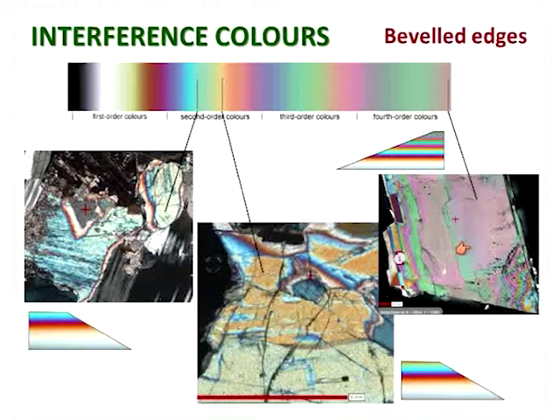By the time you get into third order, you're talking about very odd, slightly washed out colors, which are very much more pastel. I don't know why this is, but the colors seem to be restricted to more or less a pale green and a pink. It is quite difficult to see many of the other colors in there. In fourth order, that becomes even more pronounced, so very pastel shades, quite dull really. And once you get into fifth and above, you're looking at colors that are so washed out that they're almost white, and we'll come on to that.